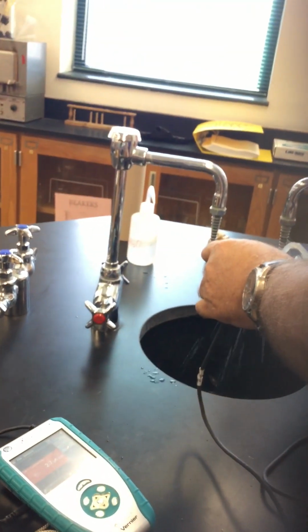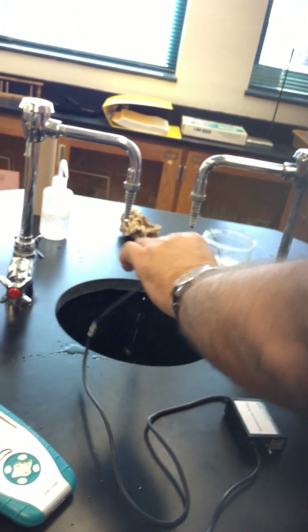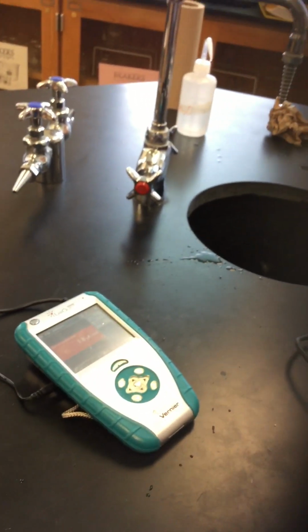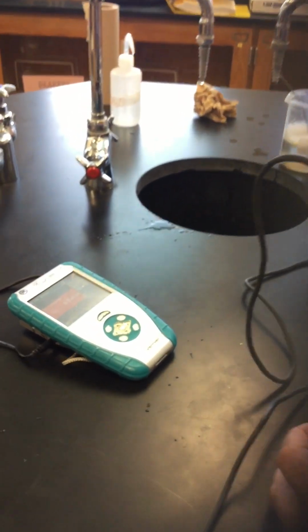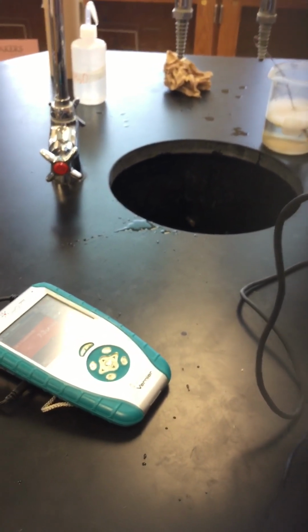That's just the contamination from the electrode. I'm gonna wash the electrode with distilled water, just like that, and I will dip the electrode into the distilled water and see the reading jump. Now it's about 7.2.